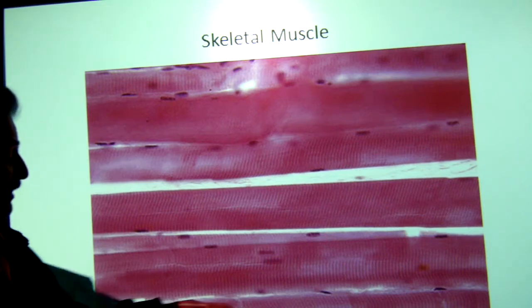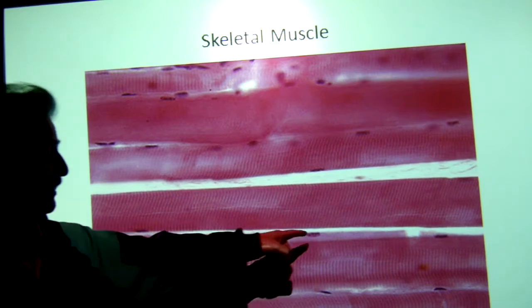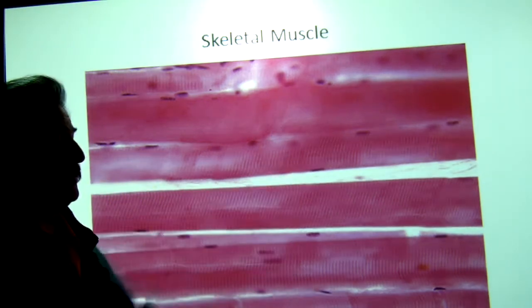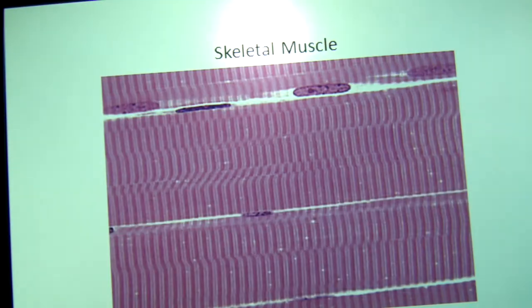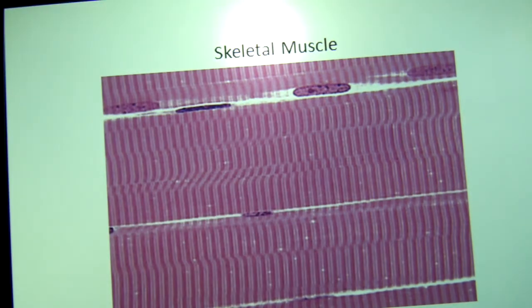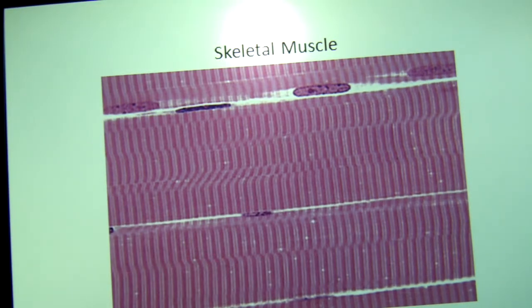we don't see the fibers going off in different directions, nor do we see the amount of nuclei that are much rounder. Since skeletal muscle is under stretch, these nuclei have a tendency to be elongated. All right, so that's what separates it. Look at the elongation of the nucleus, and then these are the many striations due to the crossing over of actin and myosin fibers.